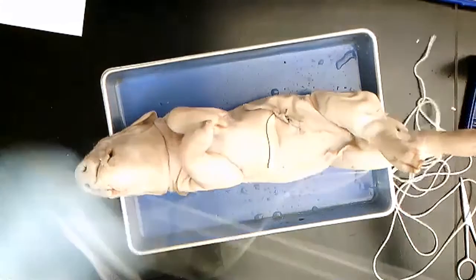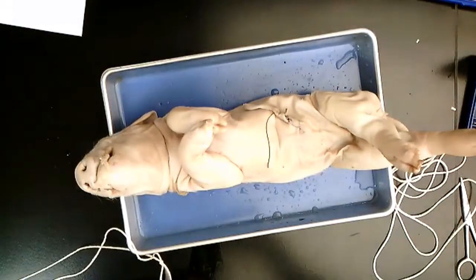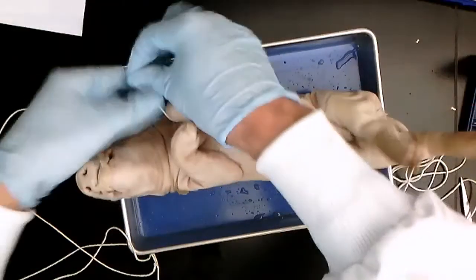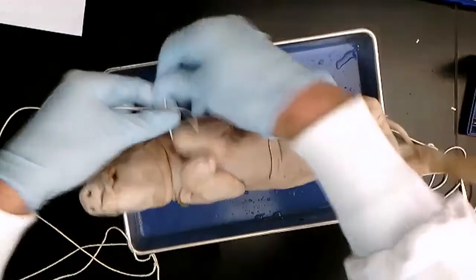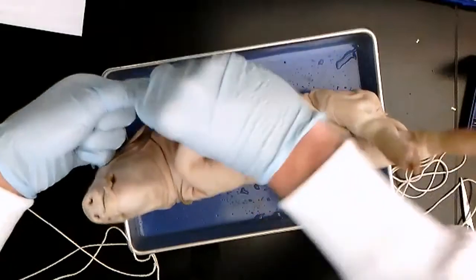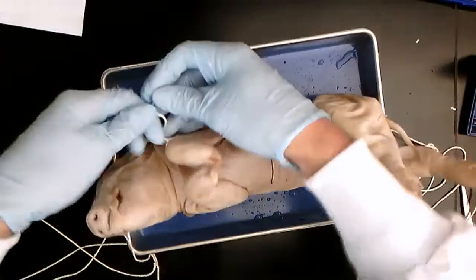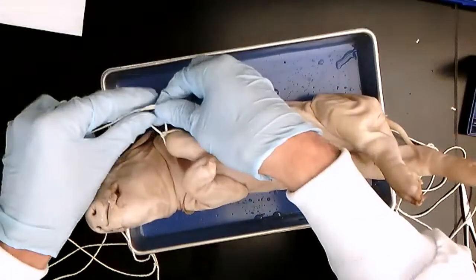So the students will be given some string at the contest to help spread out the legs. So they need to take the string, tie a knot. I would do a couple times, but it's whatever is secure.